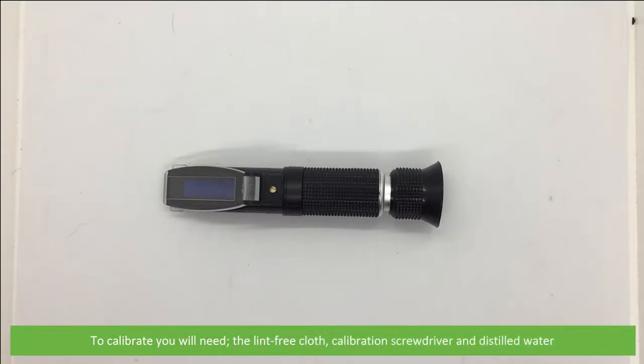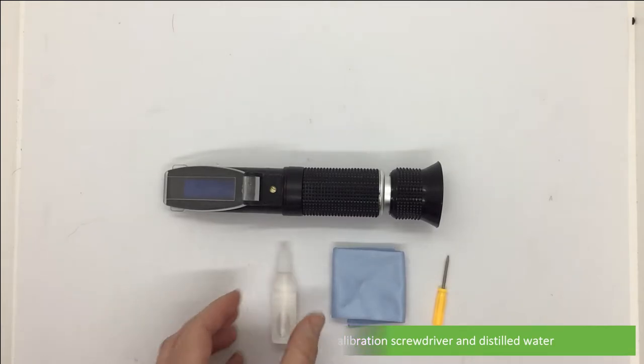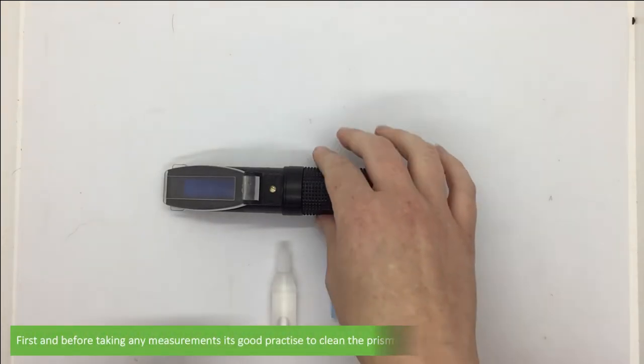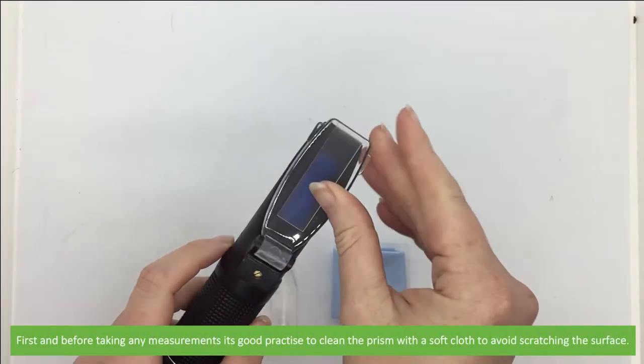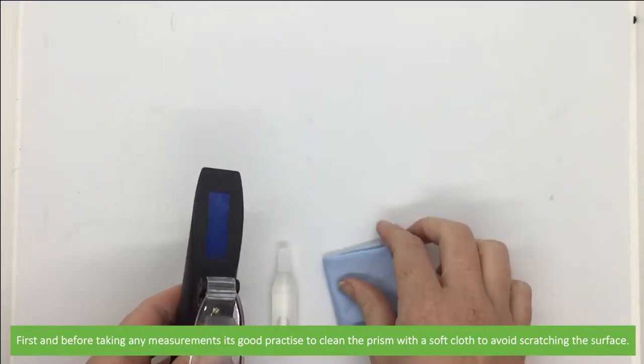To calibrate you will need the included lint-free cloth, the calibration screwdriver, and some distilled water. First and before taking any measurements, it's good practice to clean the prism with a soft cloth to avoid scratching the surface.